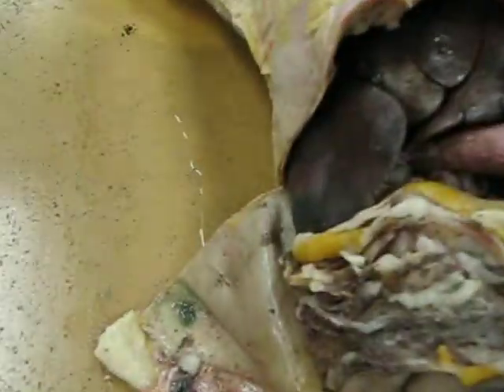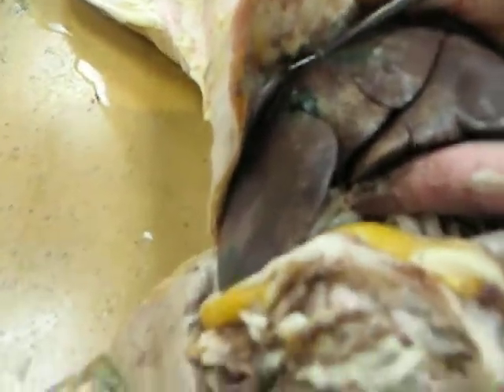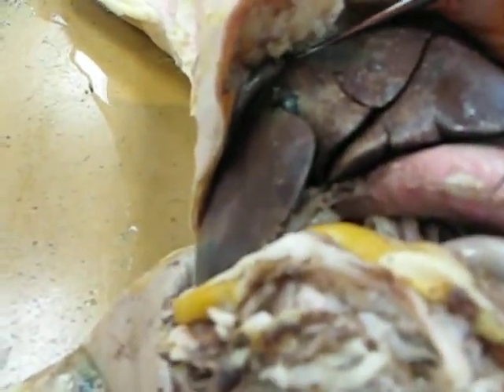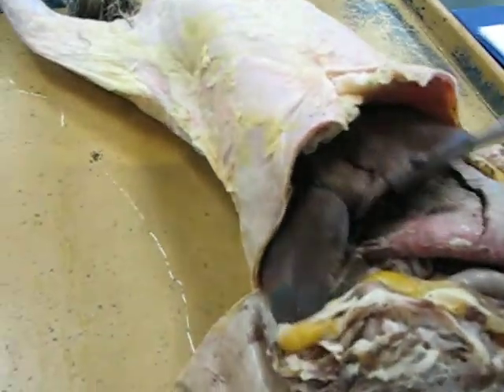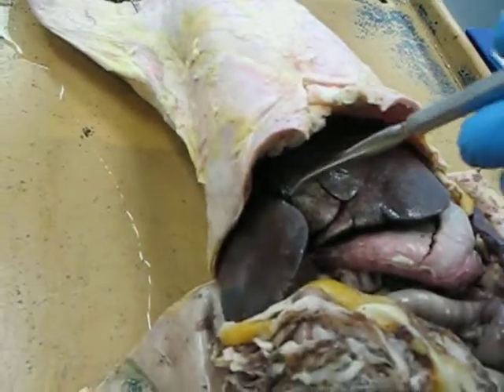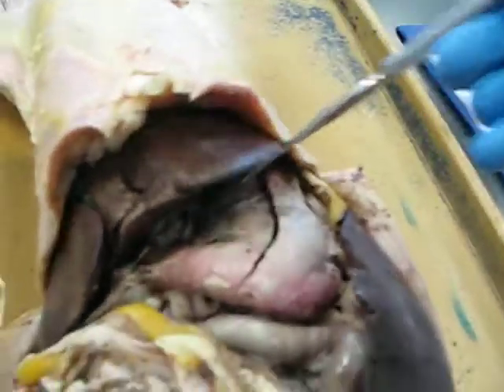Moving down, underneath the rib cage, there's a little ligament right here. Kind of barely see it. That's the falciform ligament. This large brown structure here is your liver, and there's the gallbladder in the middle. Okay, we have a stomach. This large portion here, stomach.